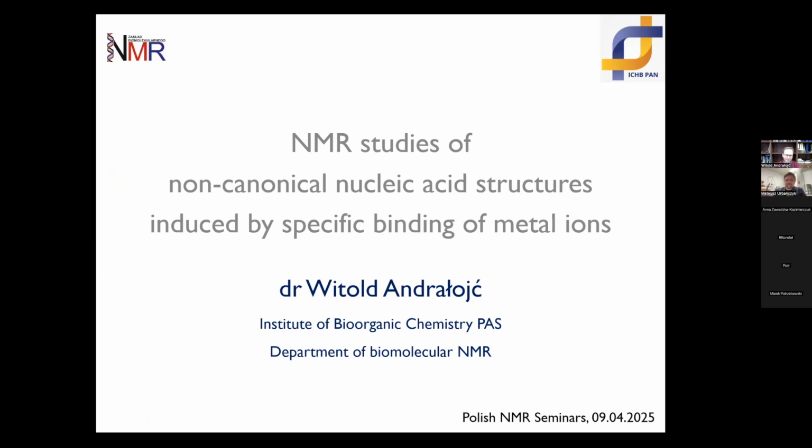So thank you again for the introduction. I represent the Institute of Bioorganic Chemistry of the Polish Academy of Science. And as Mateusz said, I will be talking about NMR structural studies of non-canonical nucleic acid structures, more specifically those induced by specific binding of metal ions.